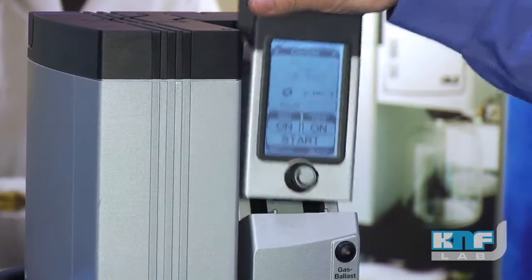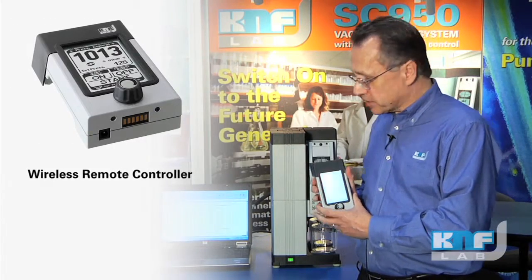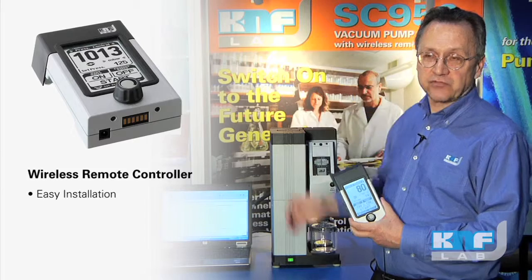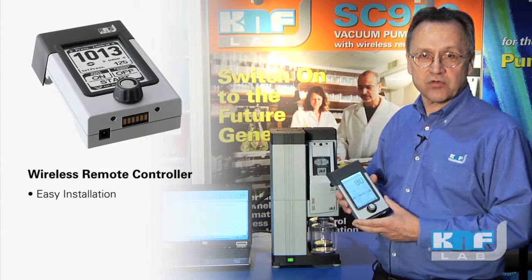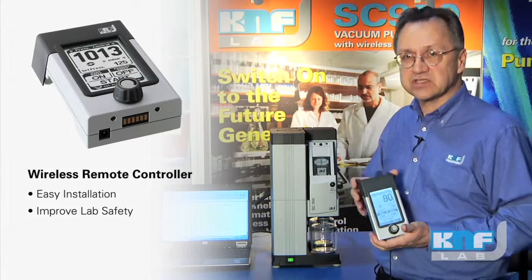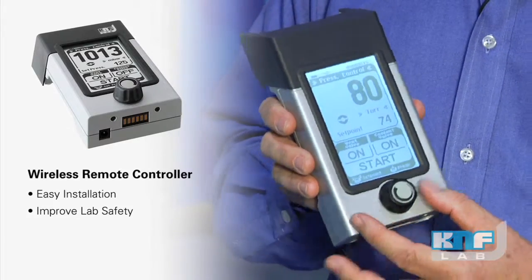Maybe the most unique feature is that we are Bluetooth-enabled, and with the Bluetooth it gives you a lot of options in the laboratory. One thing is installation options — if space is limited, put the system up on a shelf or under the bench. Because it's Bluetooth, it can be behind a closed door and you don't have to worry about line-of-sight communication. Put it inside a fume hood — if you're working with toxic solvents and safety is an issue, put it in the hood, keep the sash shut, and make all controls from out here with your Bluetooth controller.